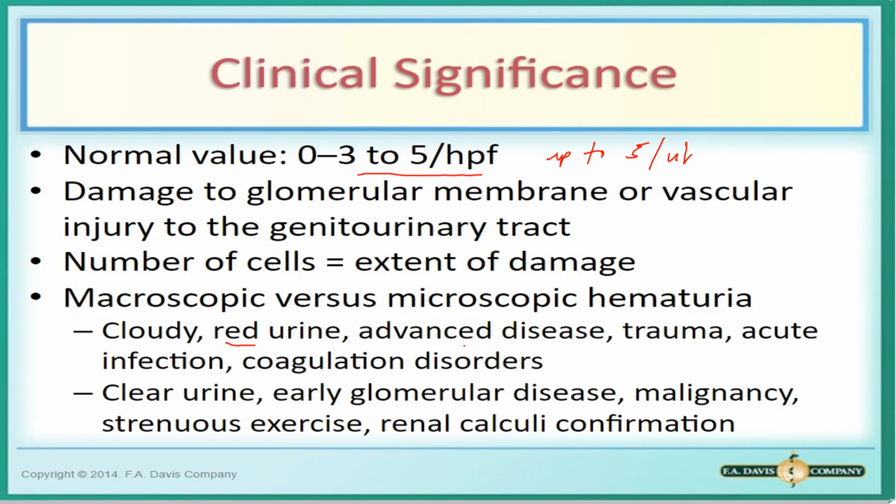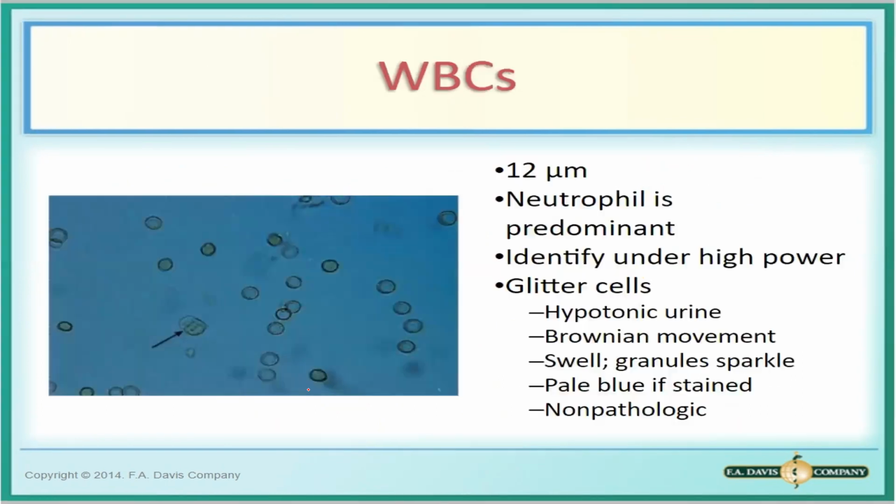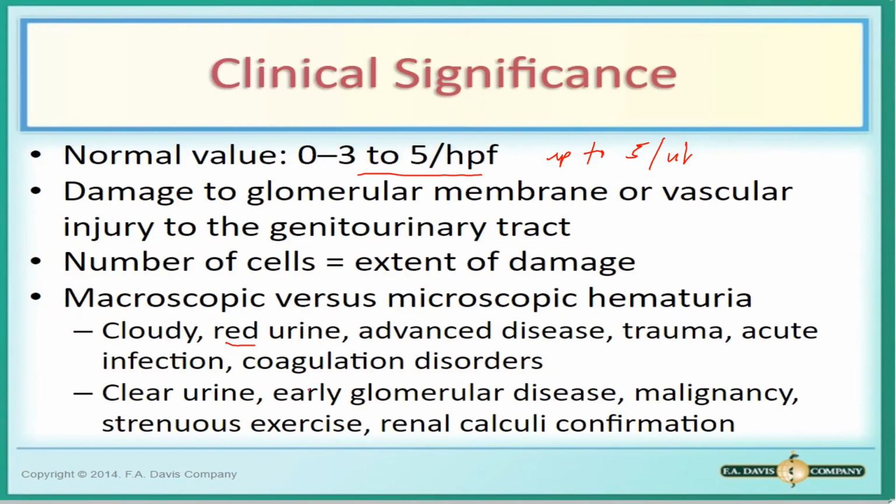So, microscopically, you can see na merong RBC. Hindi pa lang siya nag-color red. Okay? What are the other?